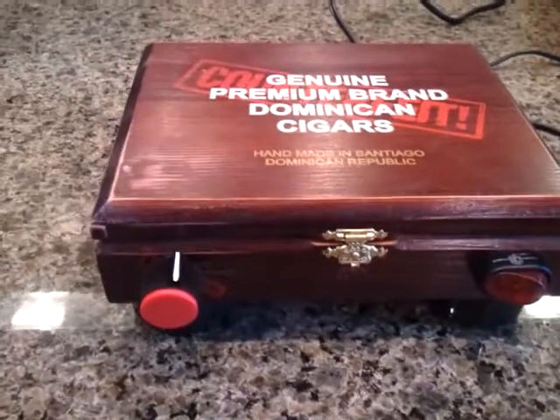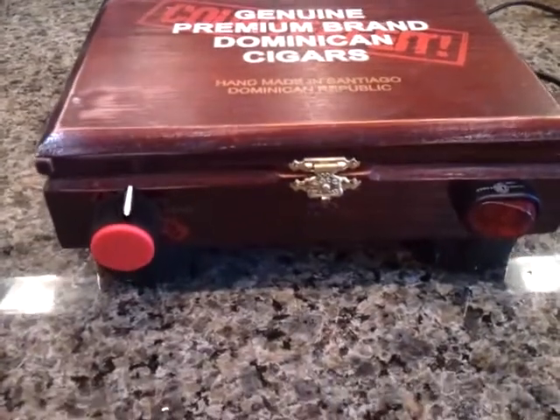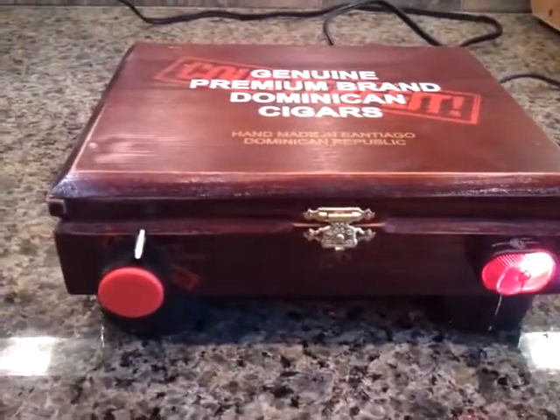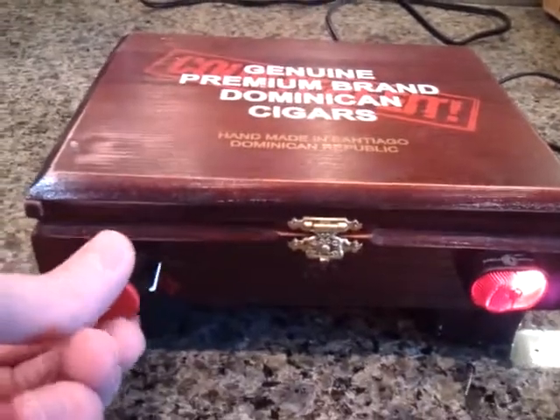The only stuff I purchased here, aside from the flask and the stir bar, you'll see is the knob and the button from Radio Shack. Flip the button, thing turns on. You can't hear it. I managed to get it centered so well, I was actually surprised. And this is your speed over here.